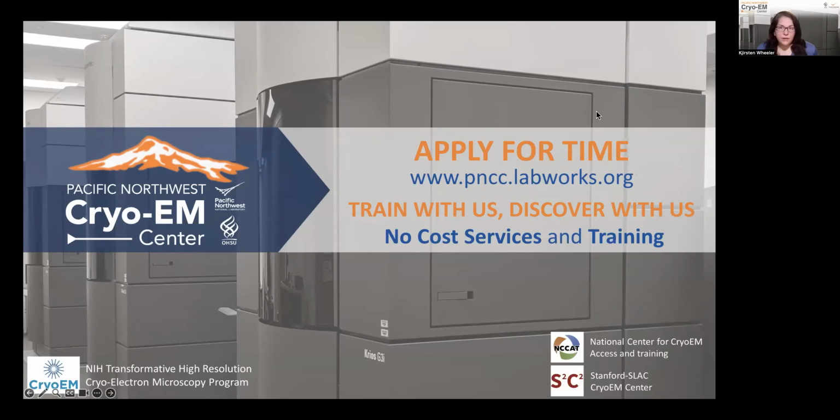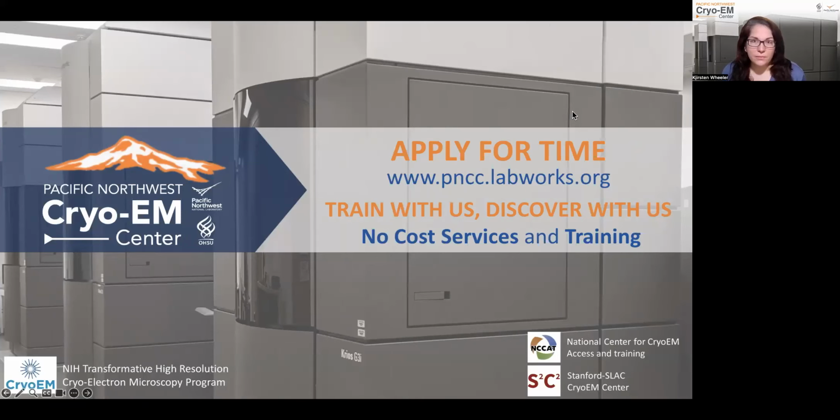Hi, my name is Kirsten Wheeler, and I'm the Administrative Coordinator for Pacific Northwest Cryo-EM Center. PNCC has two types of proposals. One is our screening access proposal, which allows one user to come on site for up to 5 days of sample preparation and screening with staff. This proposal is aimed at low resource institutions. The second proposal type is general access, which awards up to 480 hours of microscope time a year for 2 years. This time can be used for screening or data collection, and general access proposals are also eligible for our training workshops, which cover topics from sample preparation all the way through to data processing.